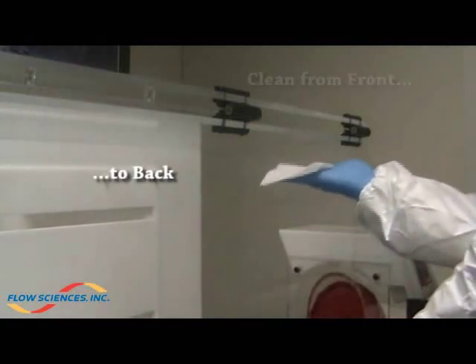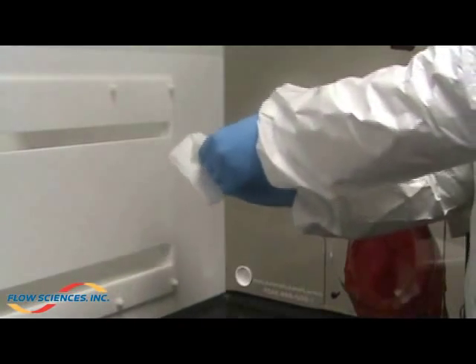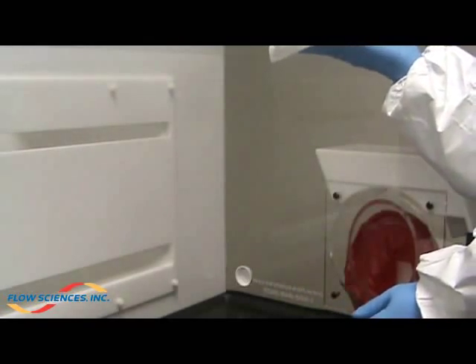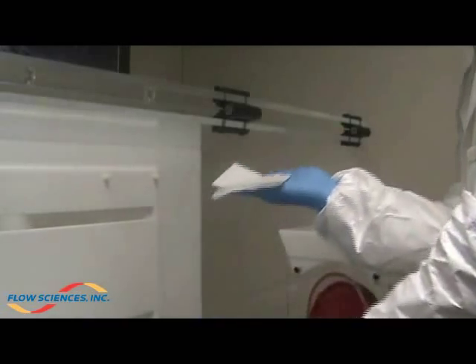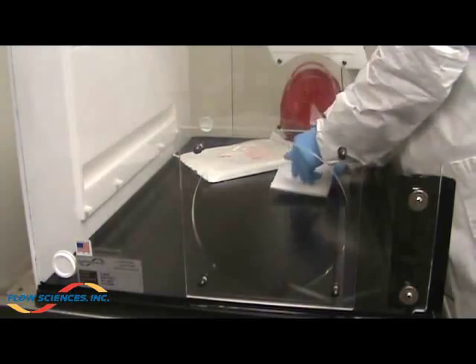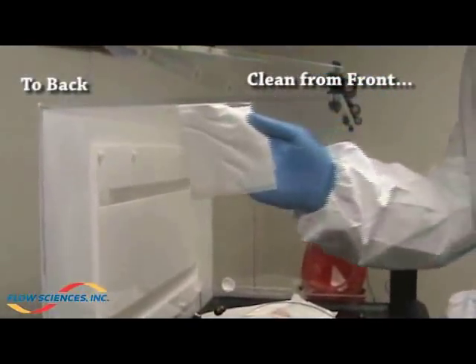Wiping front to back, clean the top of the enclosure. Wipe side walls from front to back and top to bottom.